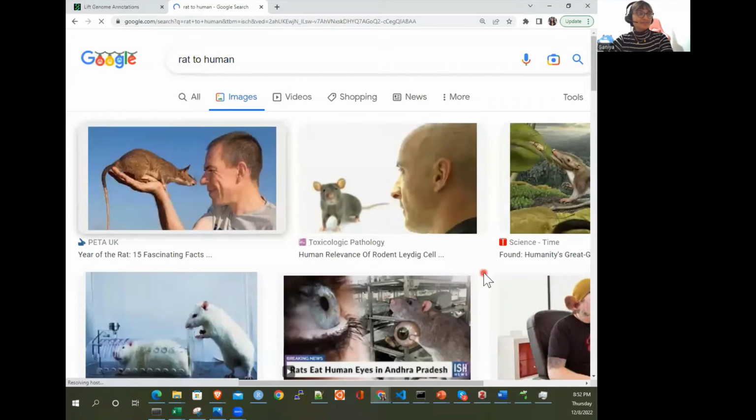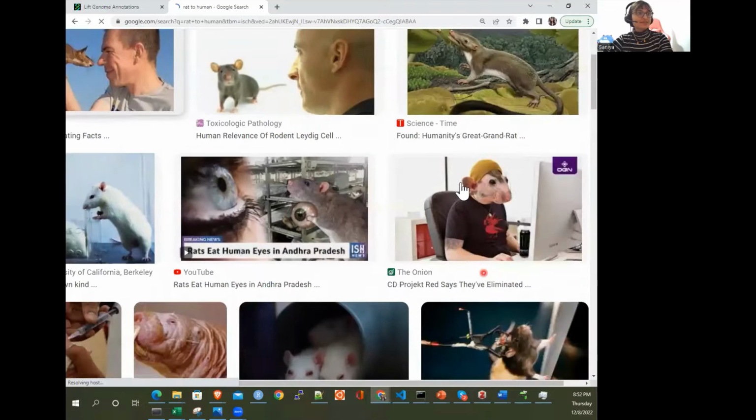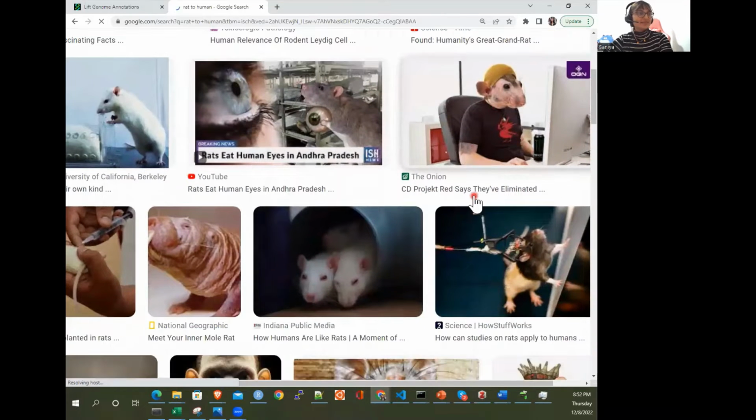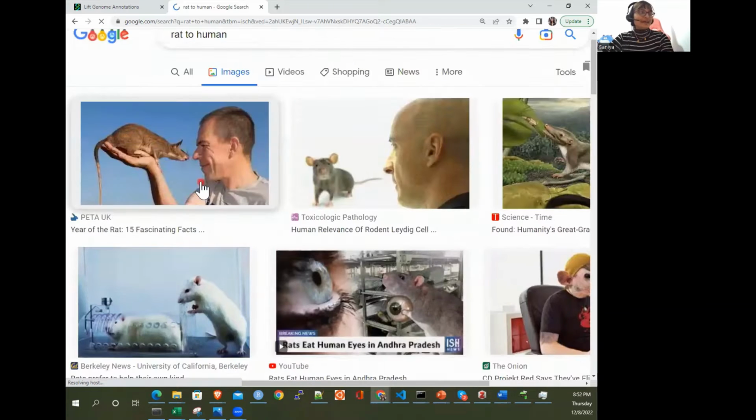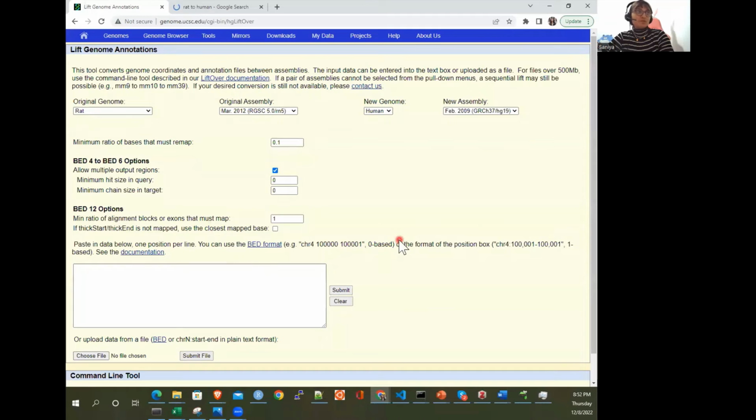There's just so many things, like a little rat sitting here. That's all we want, these poor guys. Alas. Okay, so we have these coordinates. So what do we want to do?